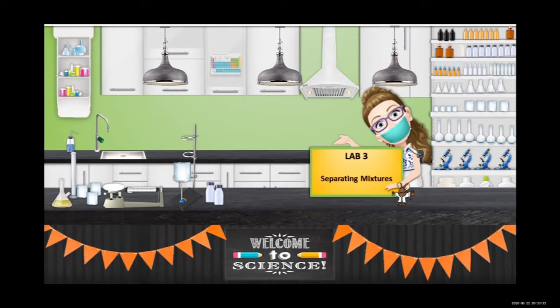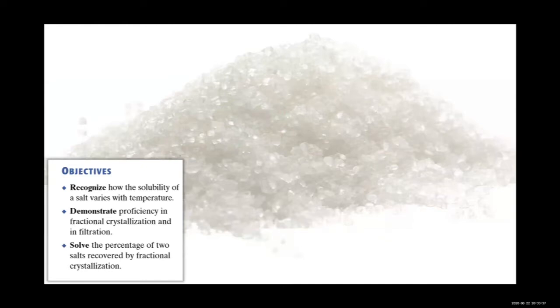Lab 3, Separating Mixtures. Objectives. Recognize how the solubility of a salt varies with temperature. Demonstrate proficiency in fractional crystallization and in filtration. Solve the percentage of two salts recovered by fractional crystallization.